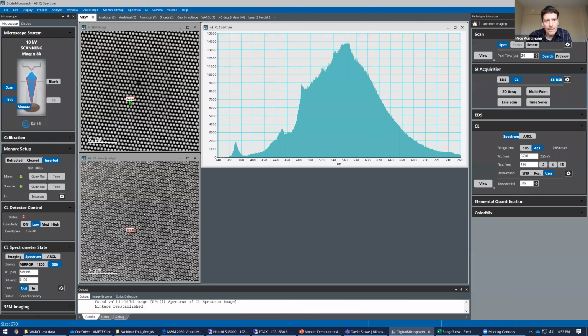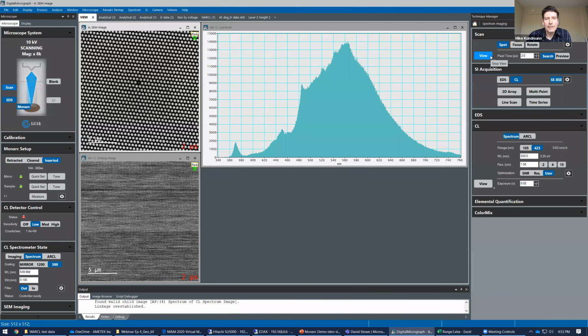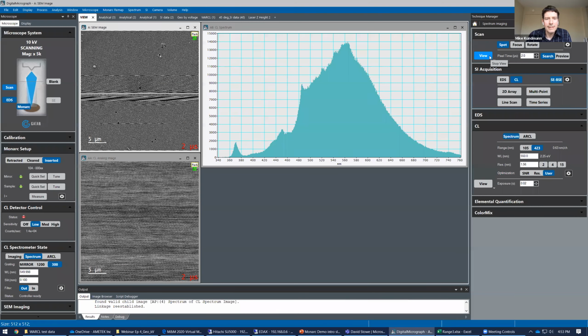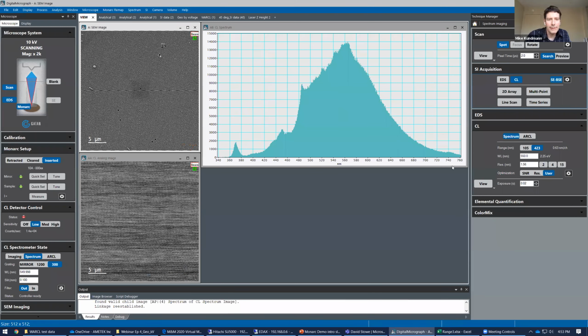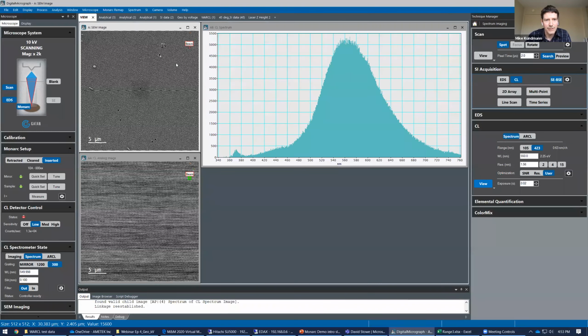Okay. So if I move my beam way over here, this is a nice flat intensity field of view. But if I zoom out, if I mag out, and I'll just do that. Okay, I think you've now made it clear to me. Now the place where the light is being generated is much further than before. Exactly. That impacts how it enters the spectrometer, and that's what the slit is affecting, how large an area you can actually acquire spectra from as you're scanning the probe. Precisely.